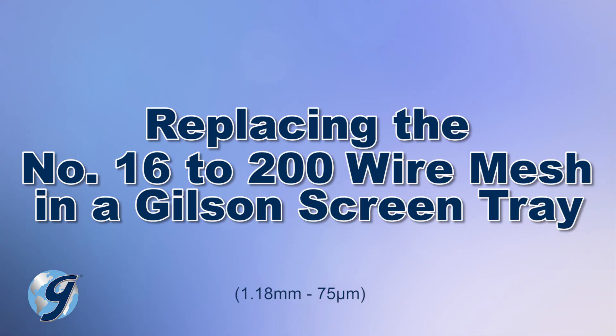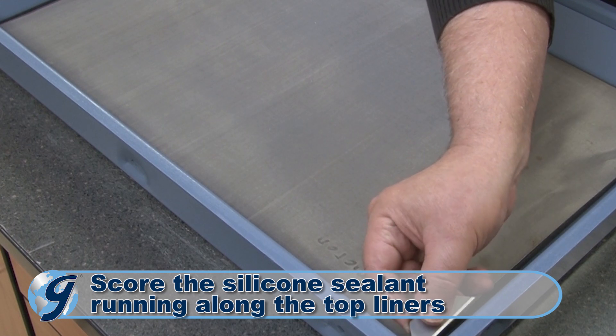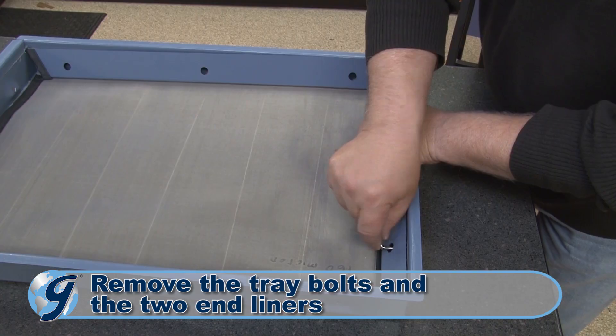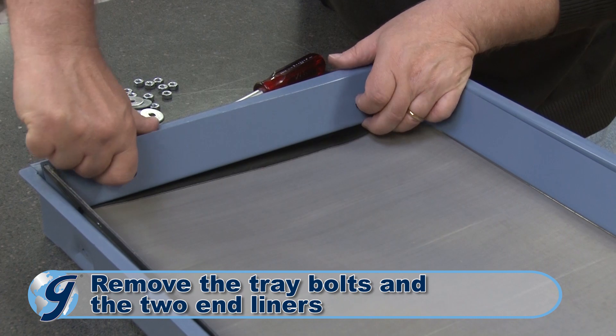For replacing fine mesh wire cloth in a screen tray, you first score the silicone sealant running along the top of the side and end liners. Now remove the tray bolts, end liners, and deflector if there is one present, as mentioned earlier.